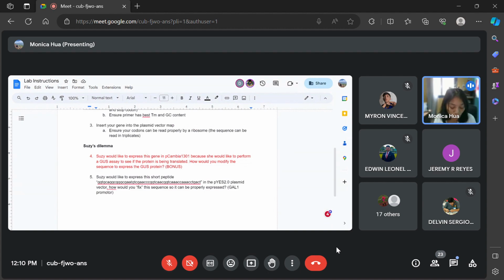All right, guys, any questions? Okay, one last one. The software saves all of our projects automatically, right? Yes. You could form different project folders too so you don't confuse yourself.